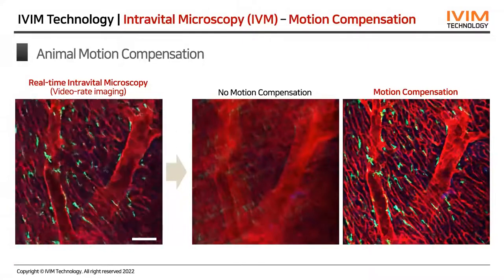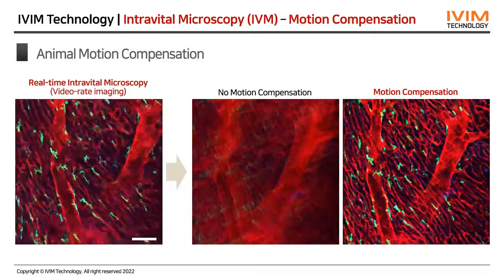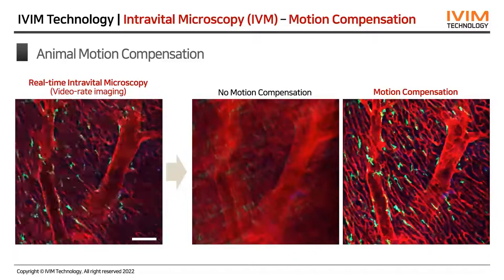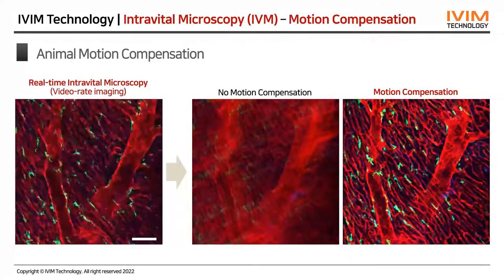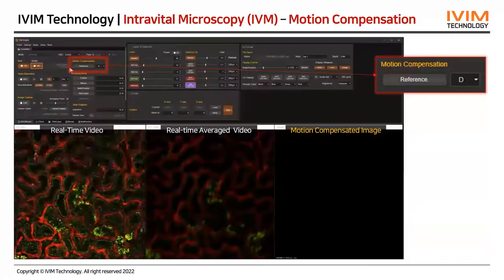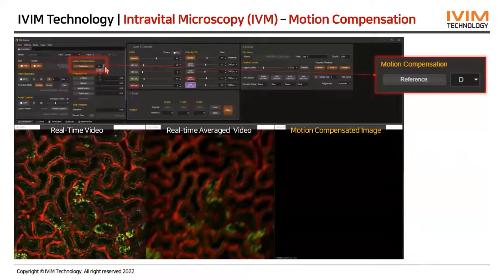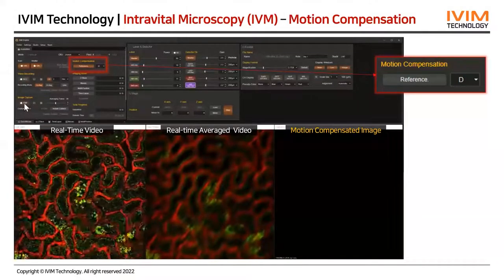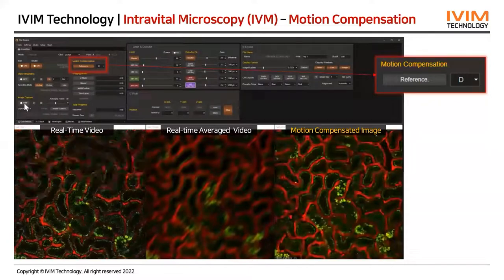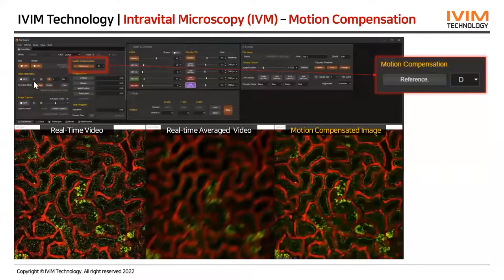This is another example with heart imaging. Even though the raw imaging data has a high degree of movement, by applying the motion compensation function we can acquire high-quality, clear images without any shifting artifact. A conventional standalone microscopy can only acquire shifted images from the same live mouse model. In the Studio software, just one click to select the reference channel, activate the motion compensation button, and click capture to get compensated results directly in the display window.